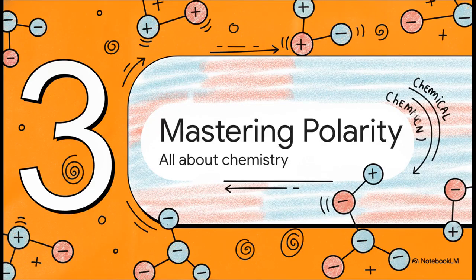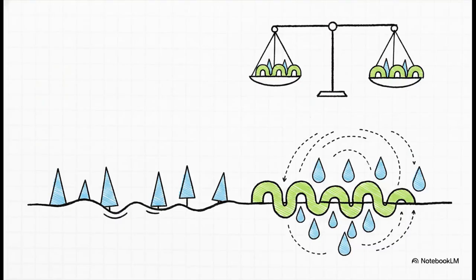Section 3. Chemical terrain, mastering polarity. Because really, it's all about the chemistry. Now, physical shape is honestly just half the battle. We also have to think about the chemical friction these molecules experience. A lot of the time, the go-to foundational material is silica gel. Silica gel is a polar material, and how it behaves is largely driven by the molecular groups on its surface.